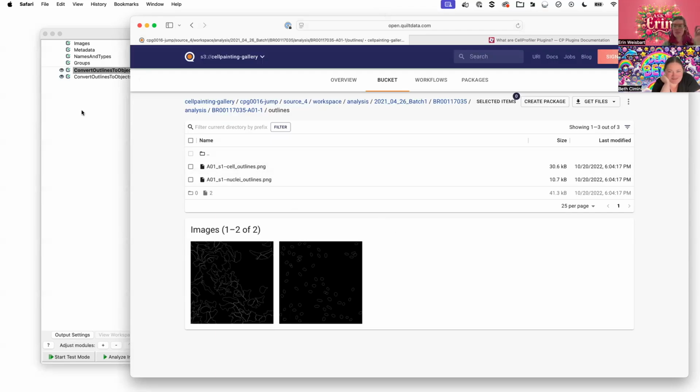I will show you in this pipeline as we go. Let's import these objects, and then I can show you the options for saving them out and what that looks like and how you might handle those. So hold the thought. We'll come back to it, since you're making me think on the fly here. And I know you can handle it. I think so. I think we'll get there.